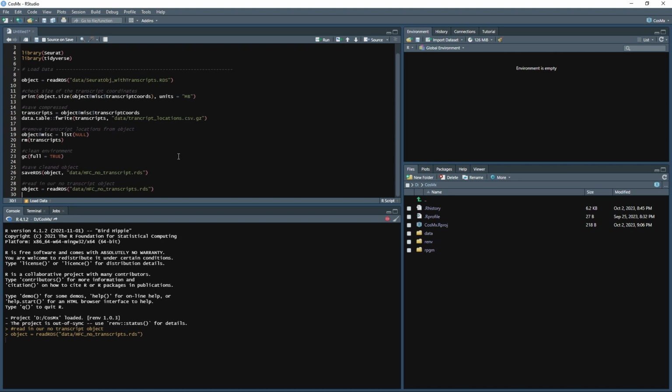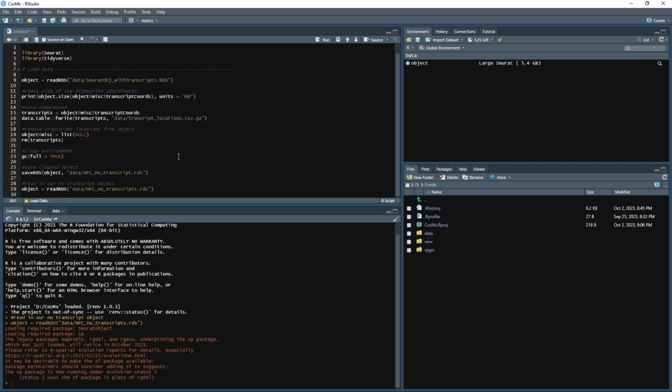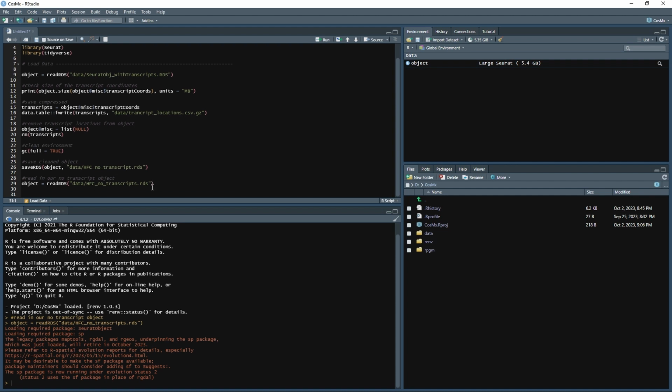There's a couple other things that I think we can remove from the Seurat object as it is right now, and that'll be our reductions. So the next thing that we're going to do, after this, is normalize our data, and then go through some of those dimension reductions, specifically principal component analysis, and then UMAP following that. So now that we have our object read in, let's look at the assays.